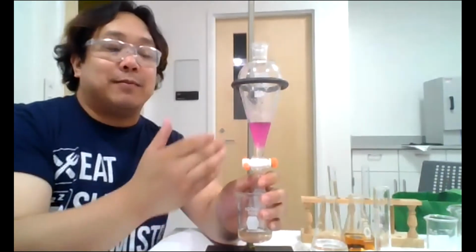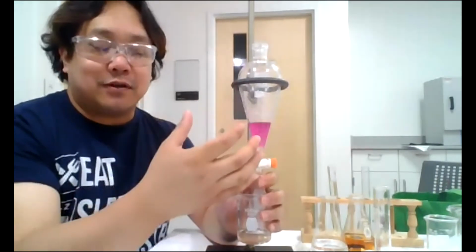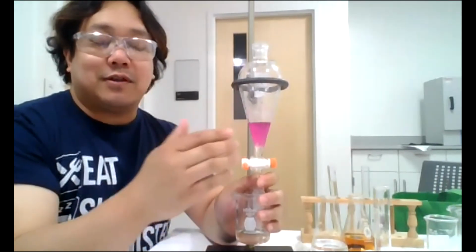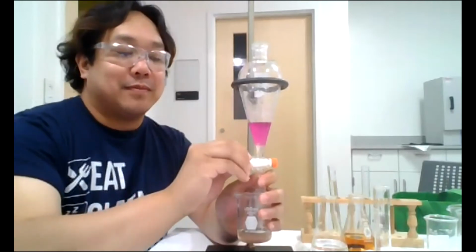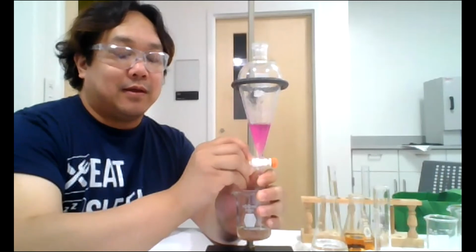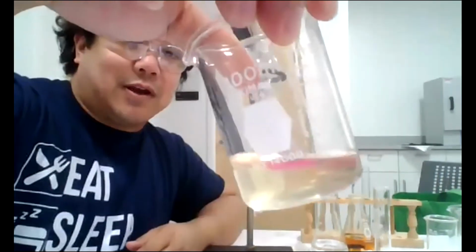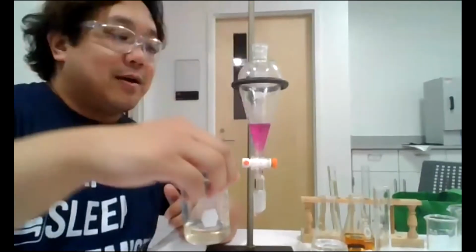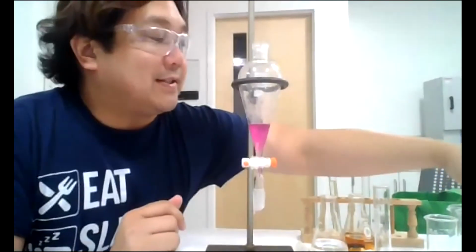Now, if you get a little bit of the pink solution, that's perfectly fine because we're re-extracting it. It's like we have a little bit of dirty laundry water, but that's okay. We're draining most of the dirty laundry water and then adding new water. So I don't mind getting a little bit of the pink solution. There's my aqueous layer, and there's a little bit of pink, but again, I am re-extracting it. But this is the dirty laundry water that goes into the waste.